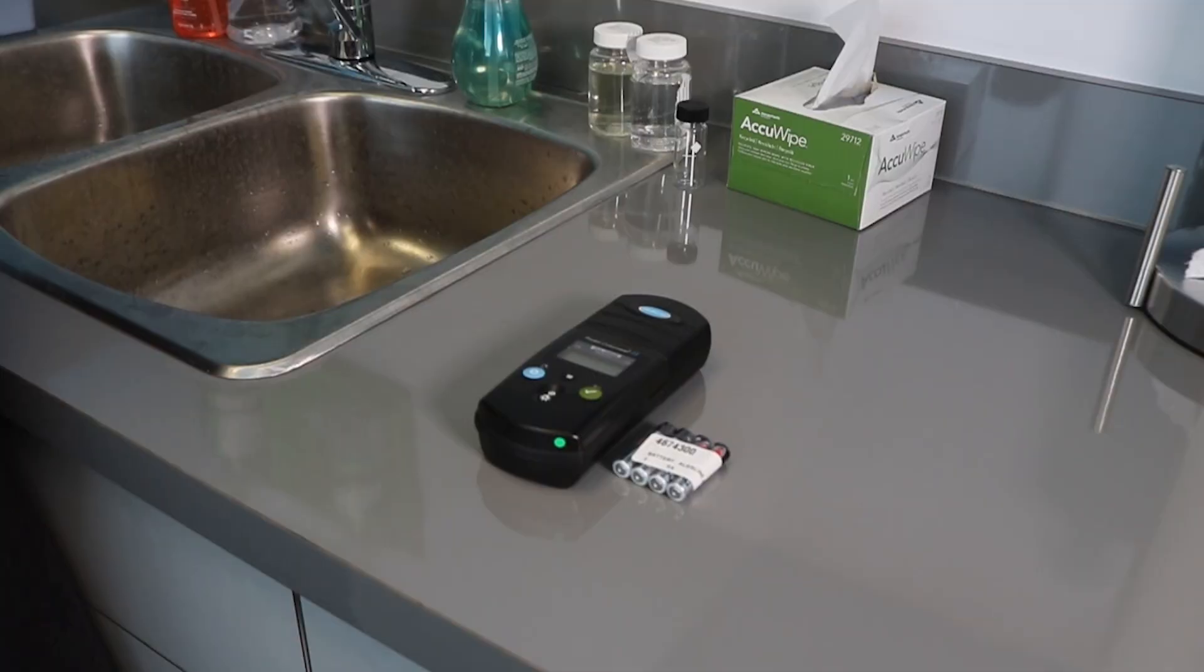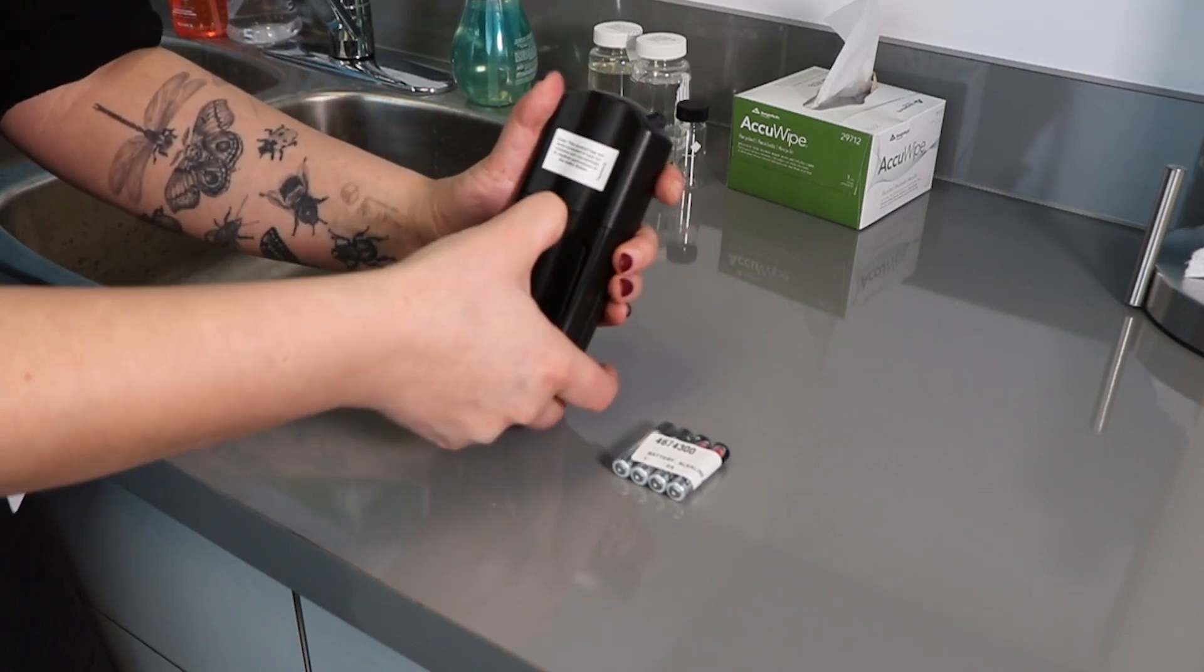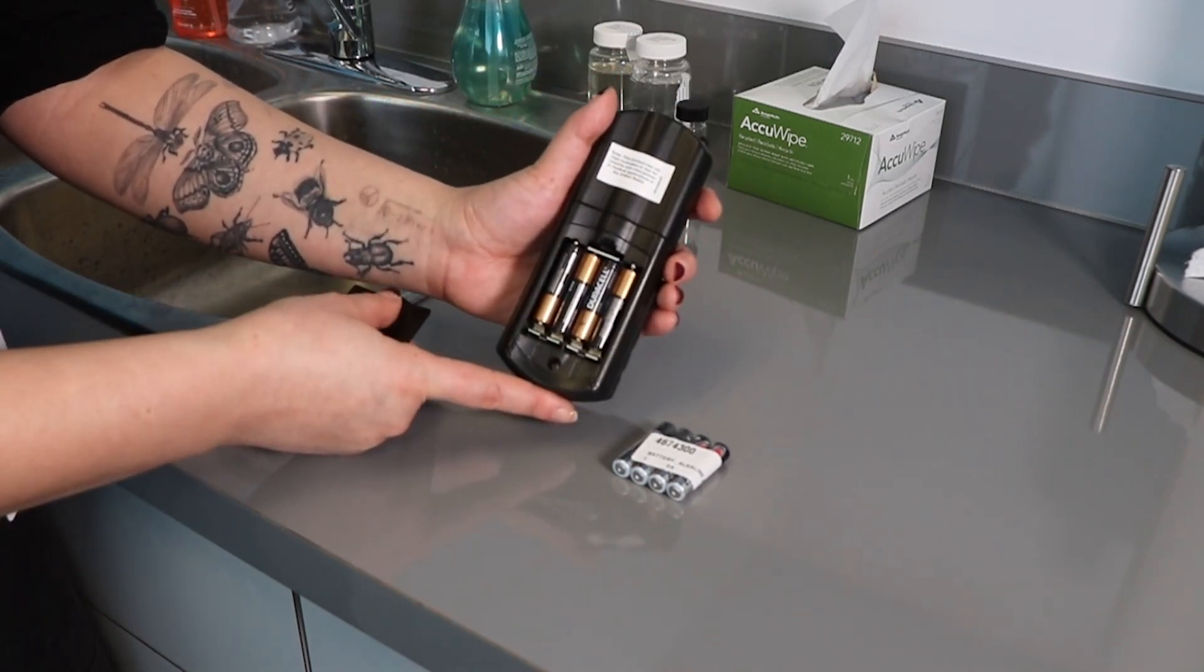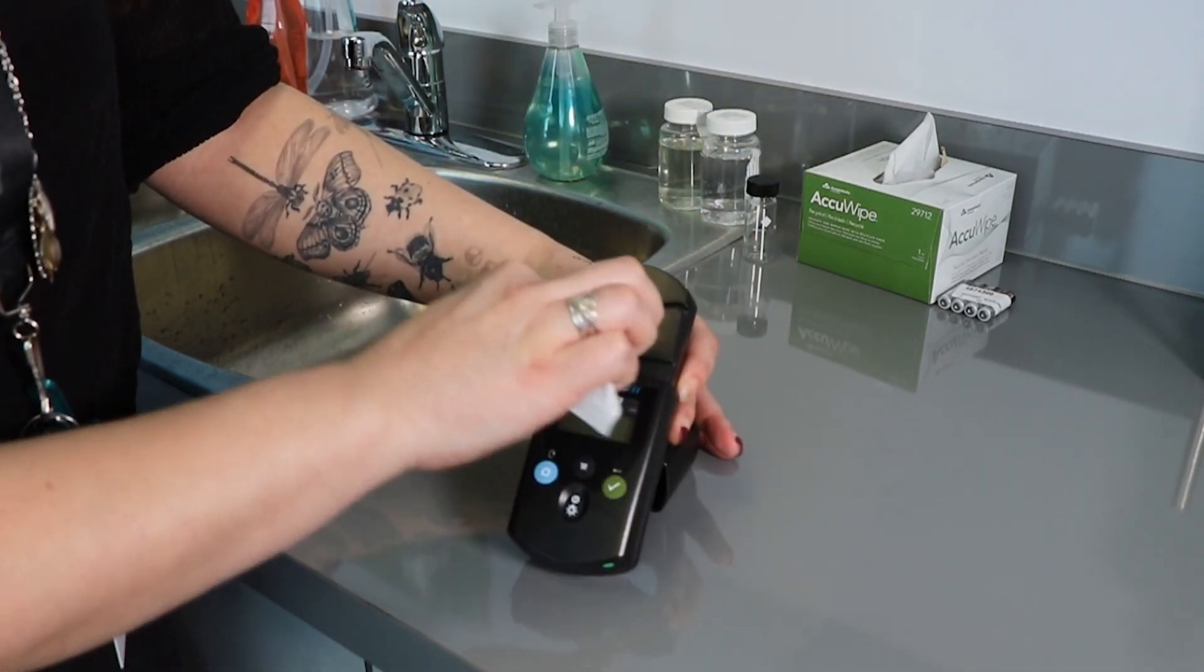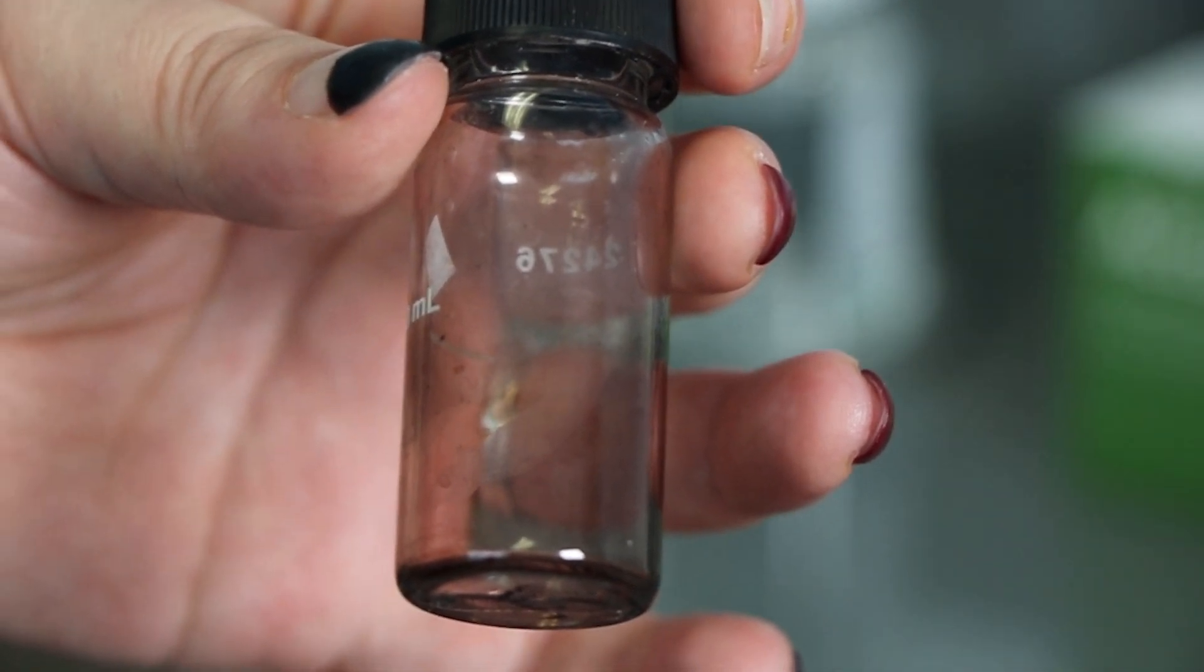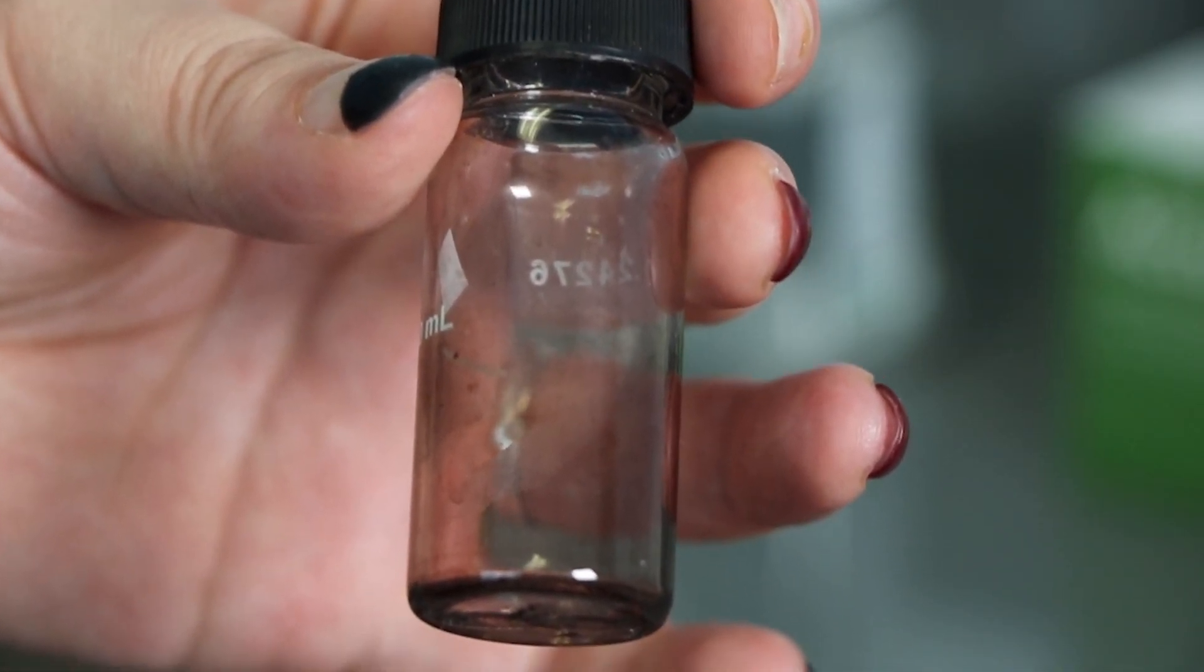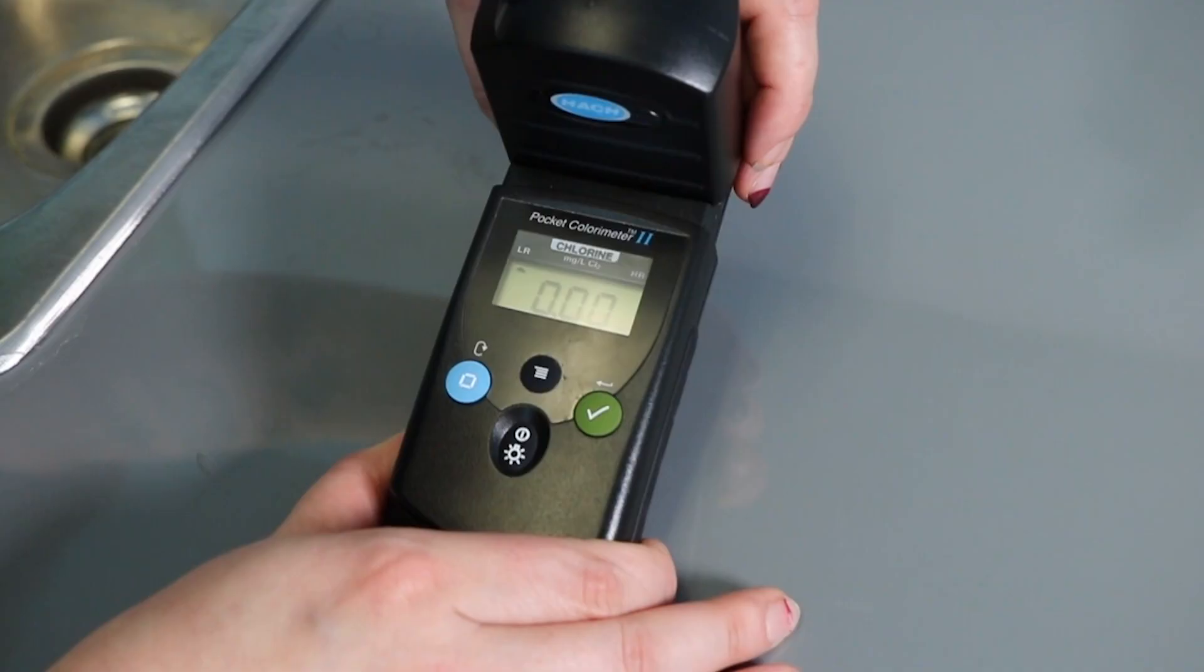If you are consistently getting readings that are outside of the normal range, it is important to troubleshoot your monitor and check for the following issues. Do the batteries need replacing? Is the light inside the monitor clean? Are the sample vials clean and unscratched? Leftover reagent will stain your vials. Have you properly zeroed or blanked your monitor before taking your readings?